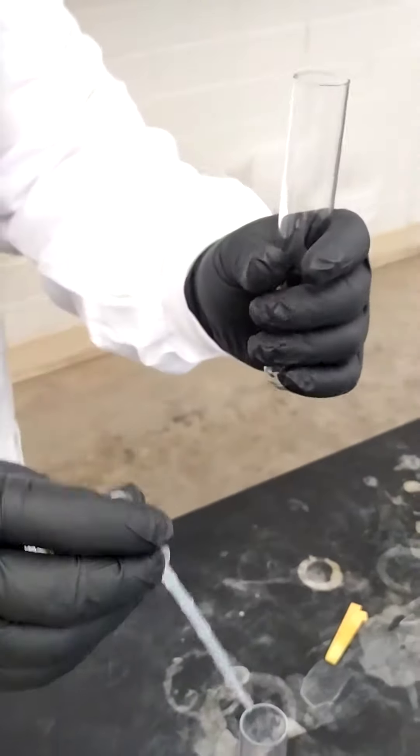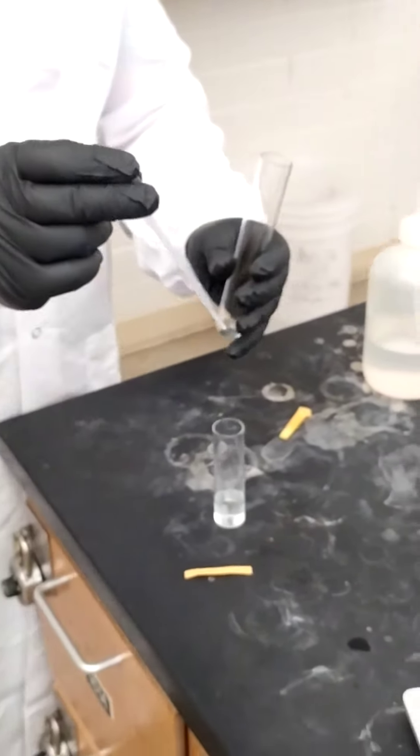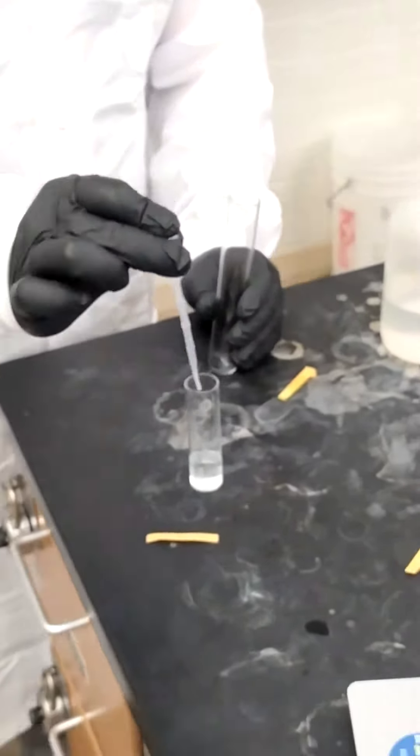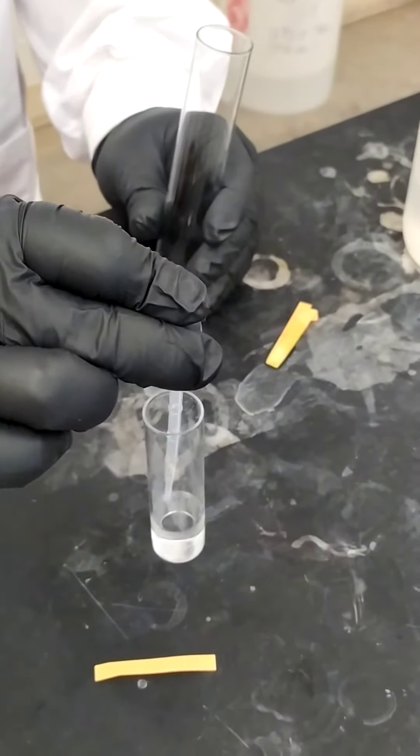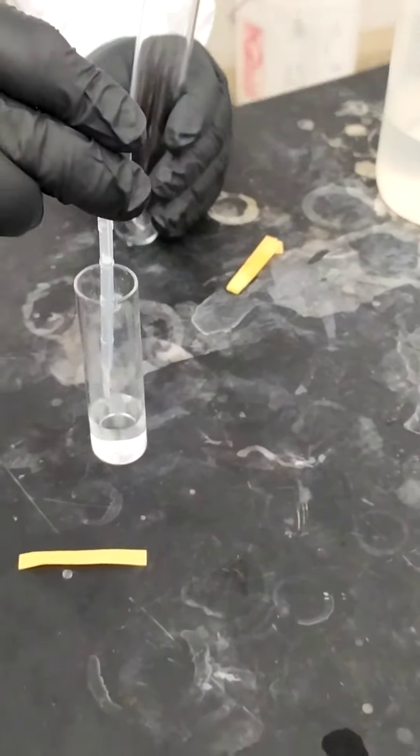So we're going to do one milliliter of this solution into this test tube. When we're doing this, we're going to squeeze the bulb here and insert it into the solution. You're going to slowly let it rise up until the line that you want.